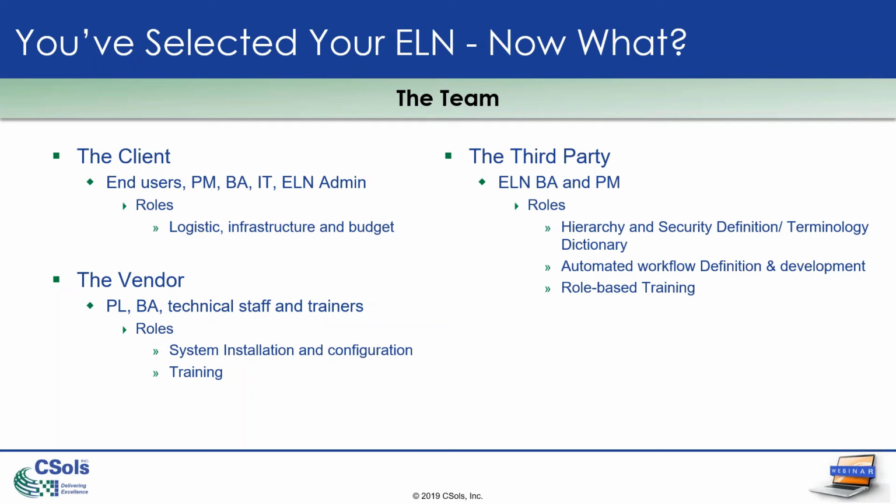Consultants can also make recommendations for the future steps, as I just mentioned, in terms of maybe integrating other systems or thinking about if there are instruments or equipment you might interface to your ELN. Most of these roles are filled in general by ELN project managers and business analysts.